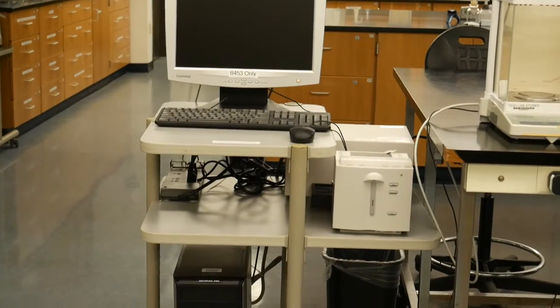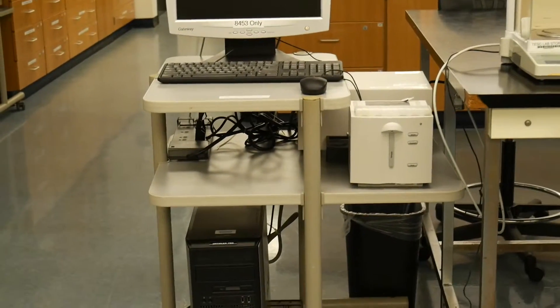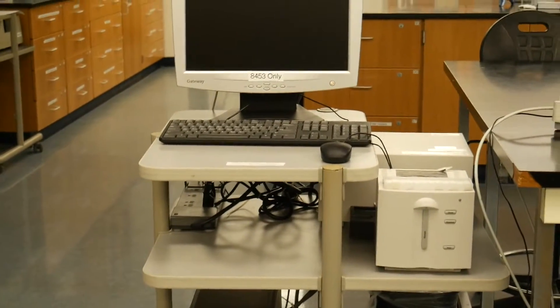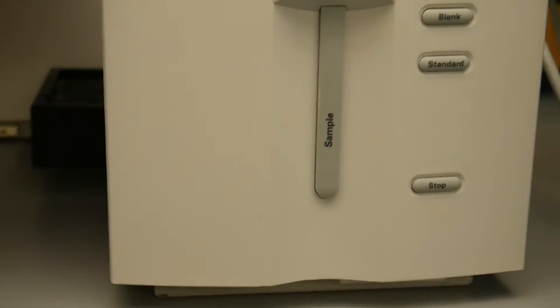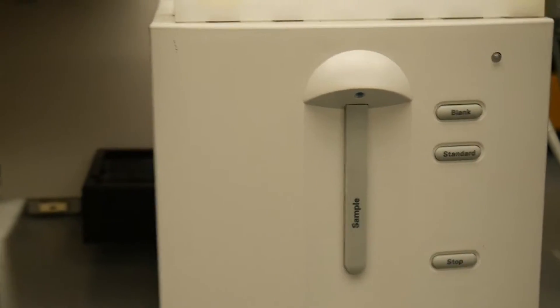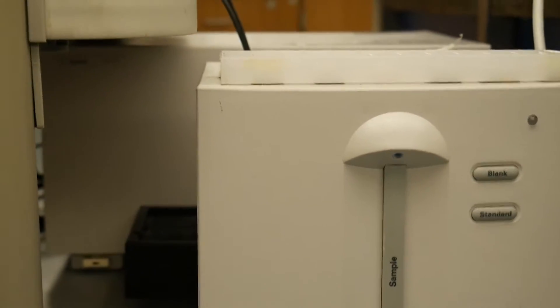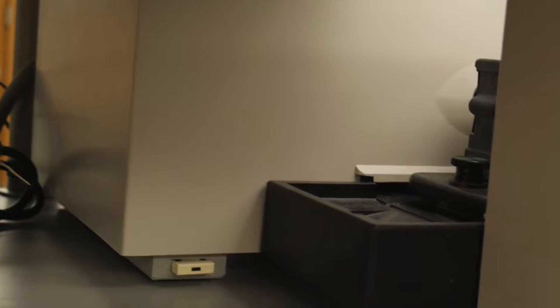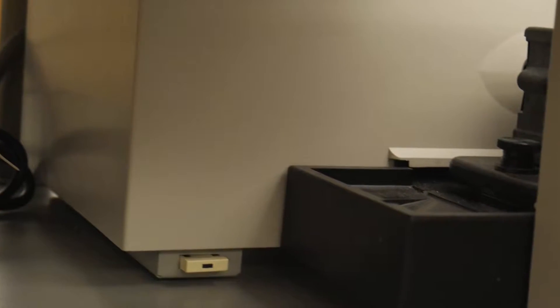The newer one, like the one I'm working with today, is identified by the buttons on the front. The power button is located just to the left of the cuvette holder.